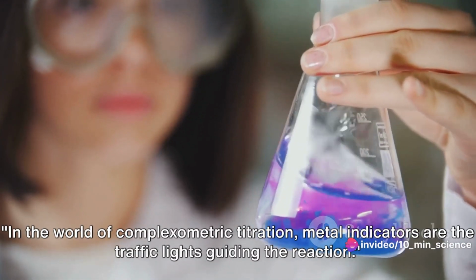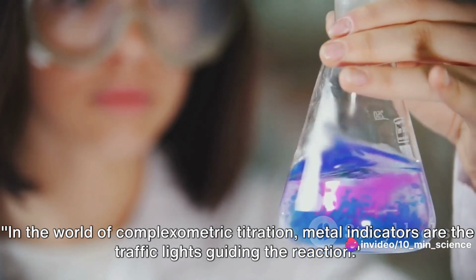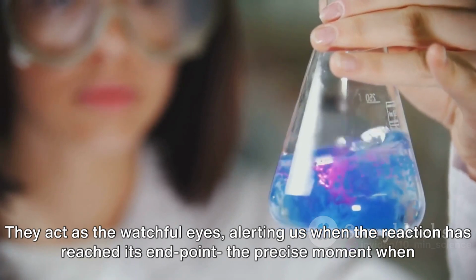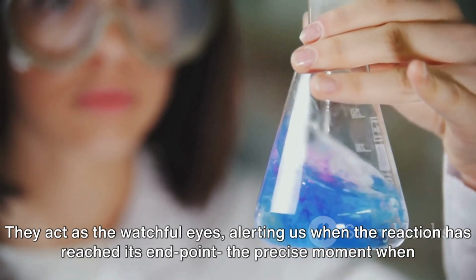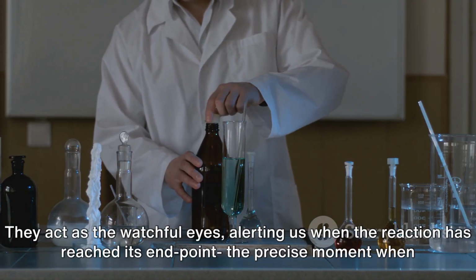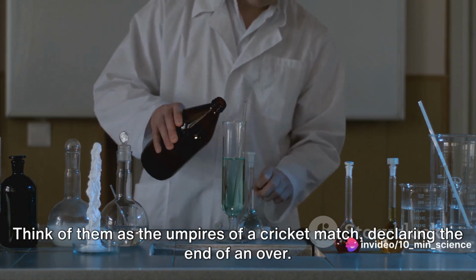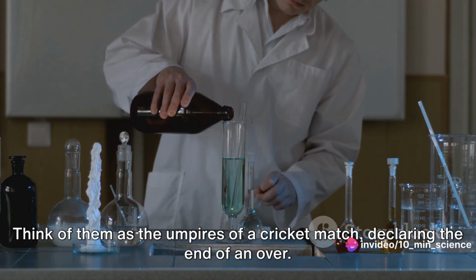In the world of complexometric titration, metal indicators are the traffic lights guiding the reaction. They act as the watchful eyes, alerting us when the reaction has reached its endpoint, the precise moment when all of the analyte has reacted. Think of them as the umpires of a cricket match declaring the end of an over.